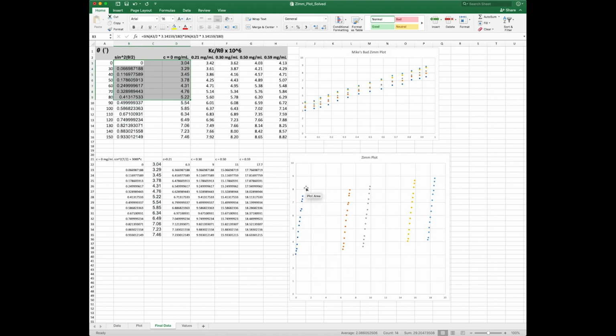On the other hand, for a fixed concentration, in this case 0 concentration, but looking at multiple scattering angles, the two curves have the same y-intercept, but there are many more points at a constant concentration than there are going this way. So in my opinion, it's better to fit this data because we've got more points, and so hopefully we can get a better least squares fit.